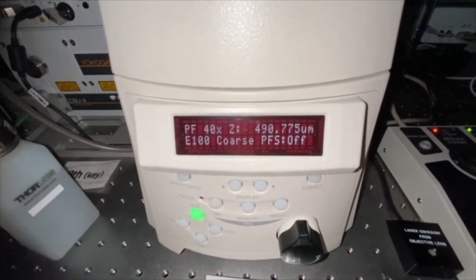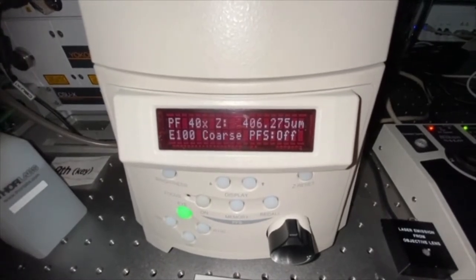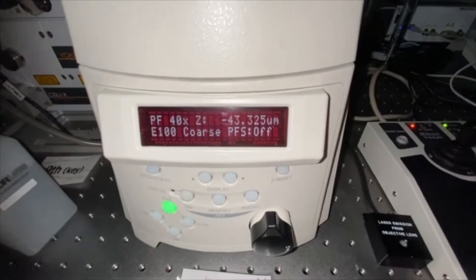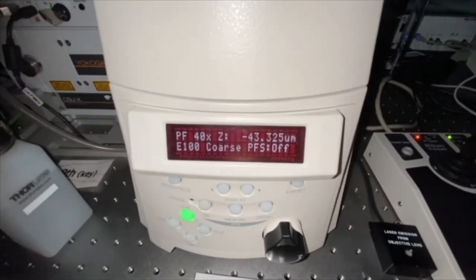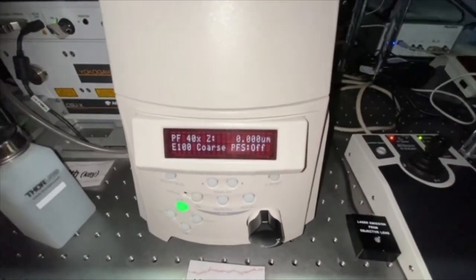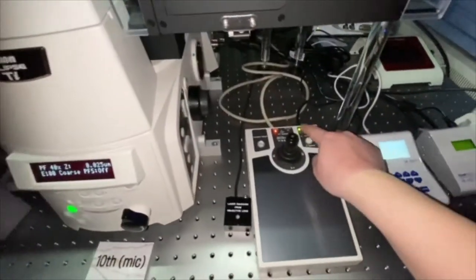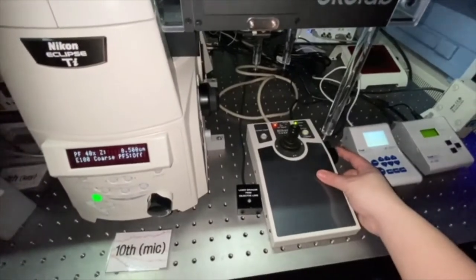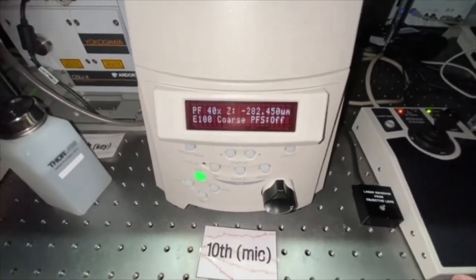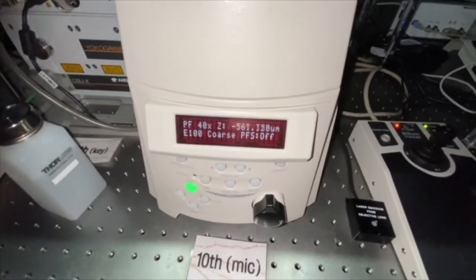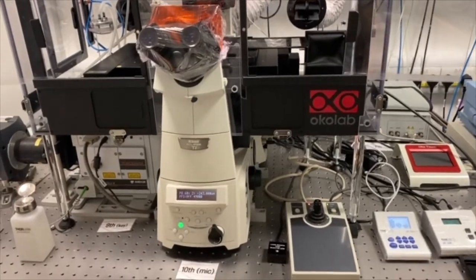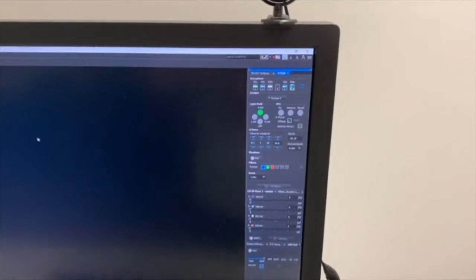Move the wheel and make sure the numbers are getting smaller until the number stops moving. When it stops moving, you know you're at the bottom. Please don't trust the number itself because you can zero this position anywhere. On course, one full rotation of this wheel is roughly 300 microns, so if you are not at the bottom it will be very obvious. Just go down until the number stops moving.